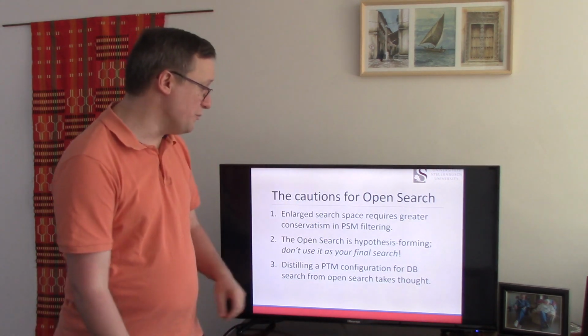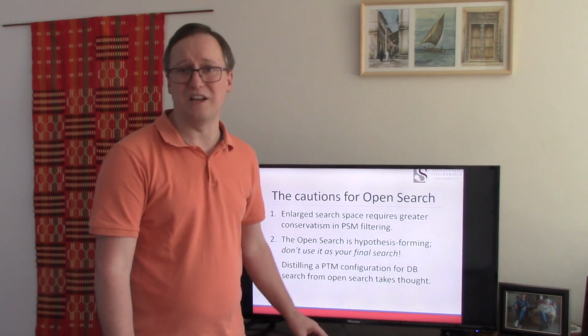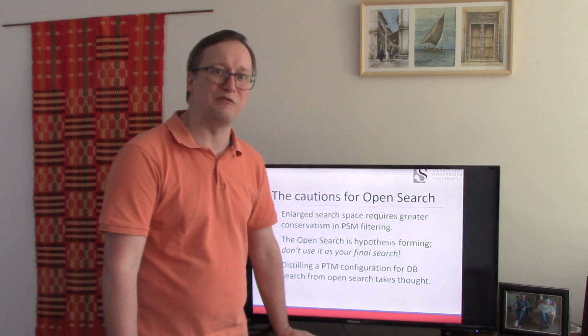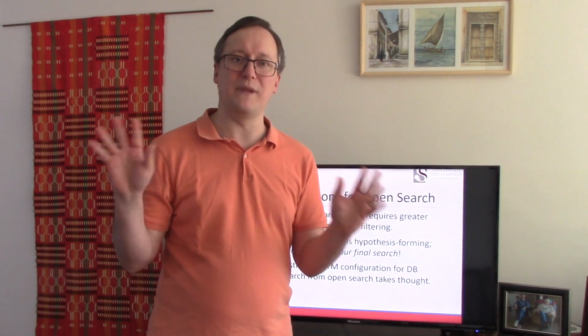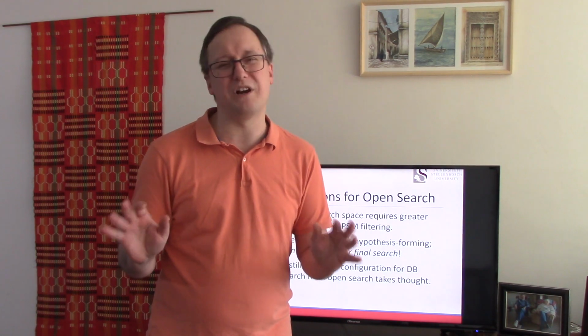Okay, next, the open search is hypothesis forming. Do not use it as your final search. This is something where I probably differ from a lot of other bioinformaticists in my field, which is to say that I feel that when we use open search, there are so many different mass shifts that come into play that the false discovery rates are not really what our software says it is.